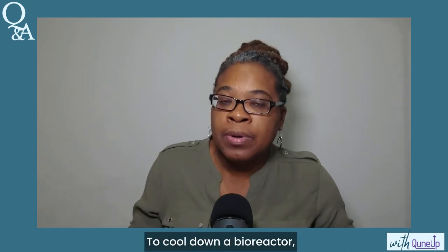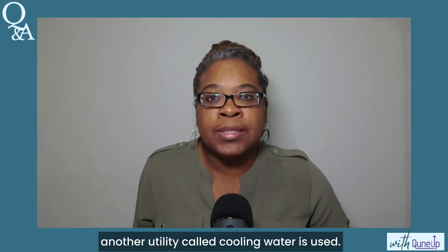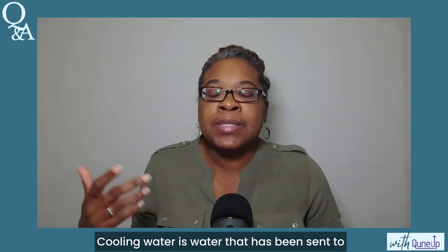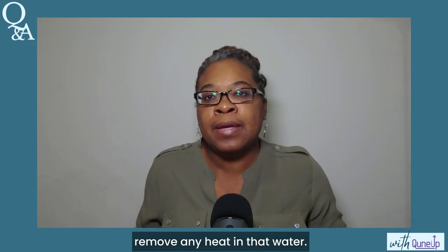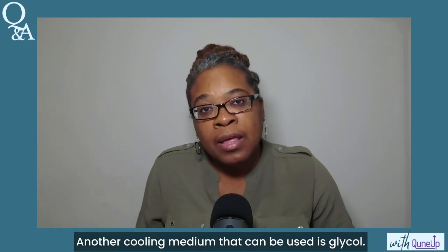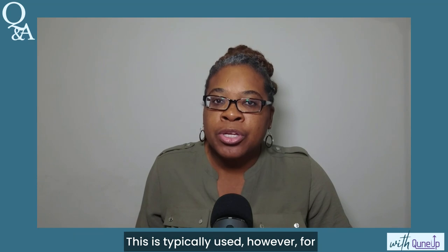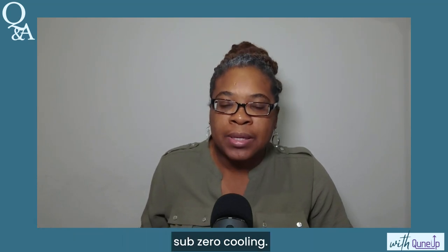To cool down a bioreactor, another utility called cooling water is used. Cooling water is water that has been sent to a cooling tower or some other heat exchanger to remove any heat in that water. Another cooling medium that can be used is glycol. This is typically used, however, for sub zero cooling.